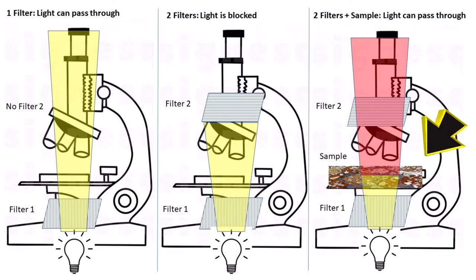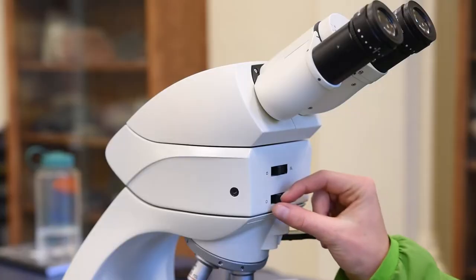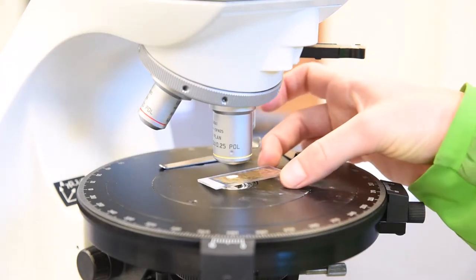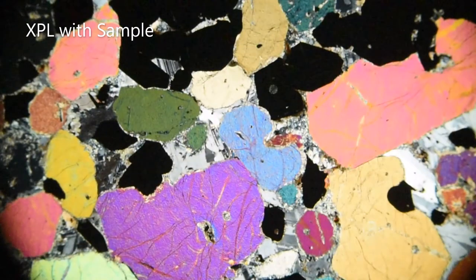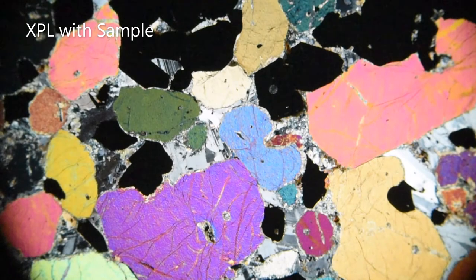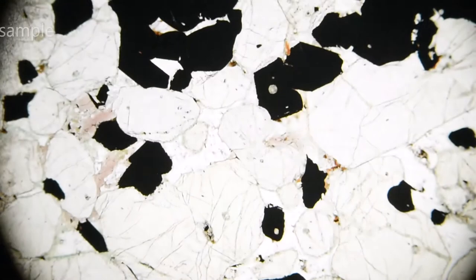However, when we place a rock sample between the filters, the minerals bend the light that would have been cancelled out by the second filter. Here's what it looks like through the microscope with only one filter. As we add in the second filter, the view turns black. When we add in the sample, we now see what are called interference colors because the minerals interfere with the directions of polarized light.